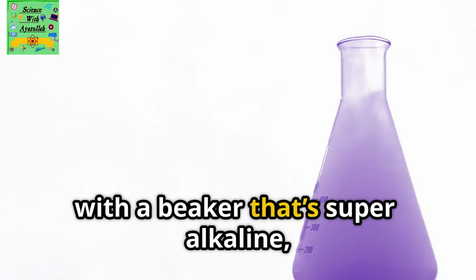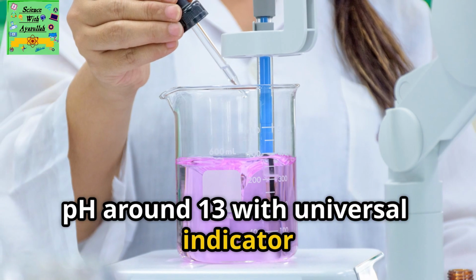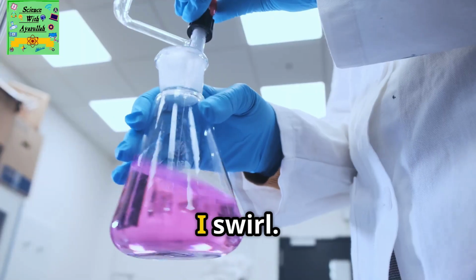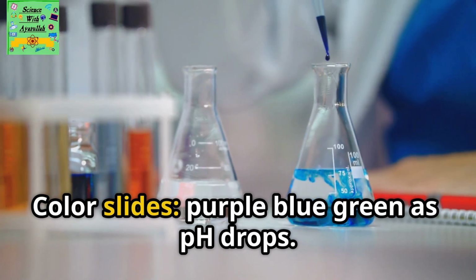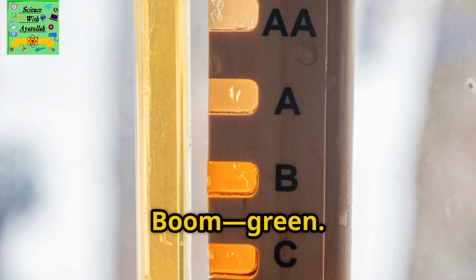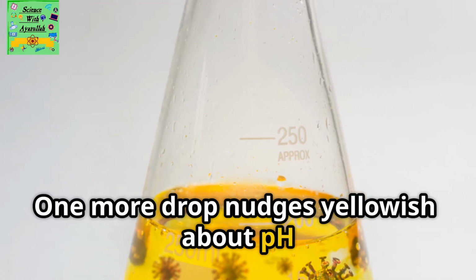I start with a beaker that's super alkaline, pH around 13, with universal indicator it's deep purple. I drip in acid slowly. Each drop I swirl. Color slides, purple, blue, green as pH drops. Hit pH 7, boom, green. That's neutral. One more drop nudges yellowish, about pH 6.